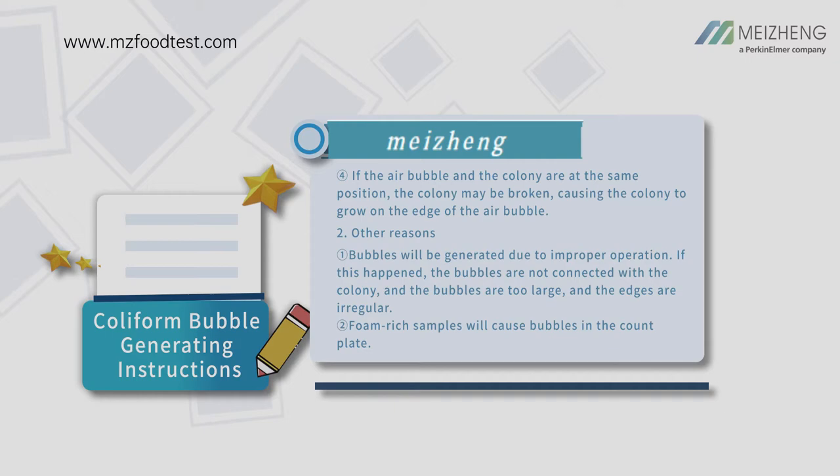Other reasons: bubbles will be generated due to improper operation. In this case, the bubbles are not connected with the colony, the bubbles are too large, and the edges are irregular. Foam-rich samples will cause bubbles in the count plate.